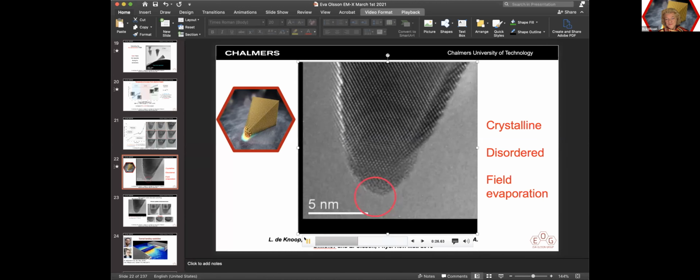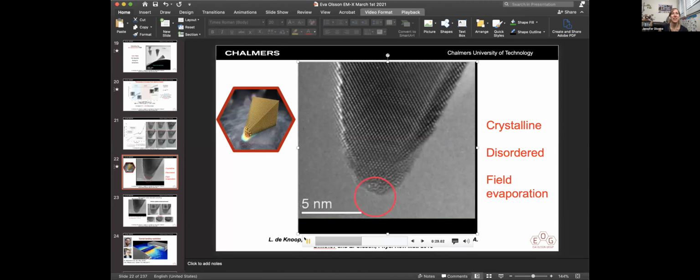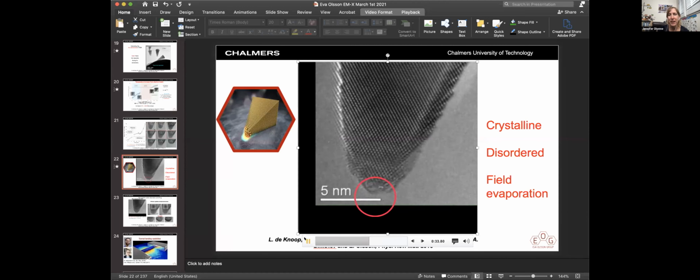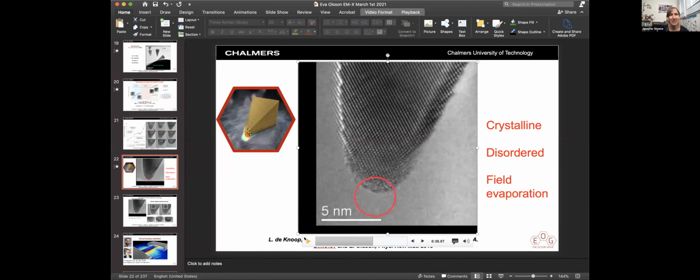Okay. Well, good motivation for those who develop detectors to keep coming up with new platforms. The final question I'll ask is back to the same experiment. This is kind of like a mini atom probe microscope that you've set up. And the audience member is wondering whether the evaporated species is deposited onto the counter electrode. If you make the analogy with atom probes, you'd expect it to be basically always the same site.